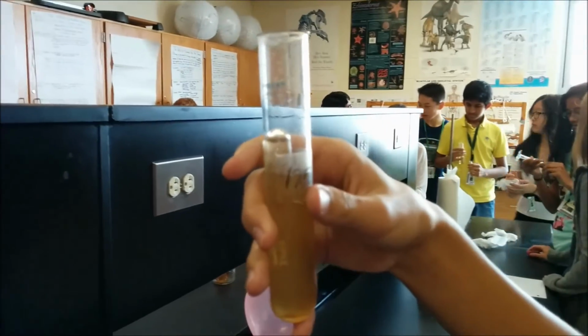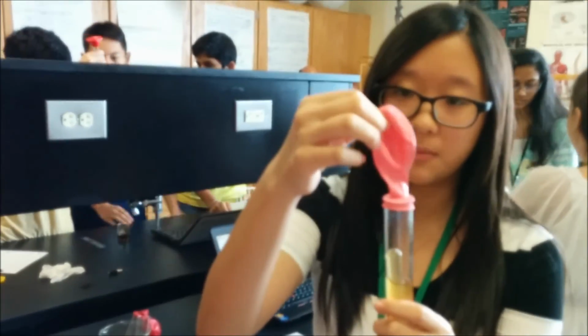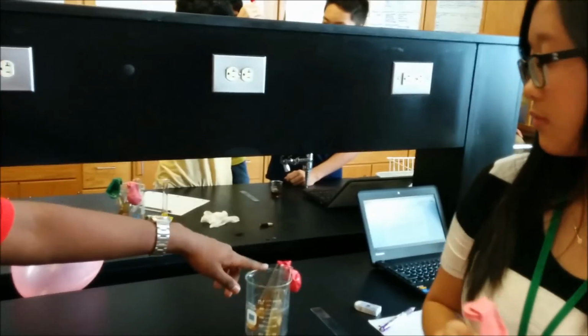Sungmi, what are these balloons? What are they for? Oh, the balloons will catch all the gas that is made, and it'll show more than the miniature test tube will. And as the gas is filled in, the balloon gets bigger. And then in the end, we'll measure the circumference of the balloon. And so you're comparing it with the other ones as well.